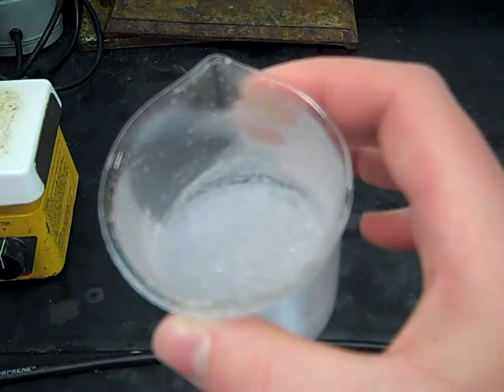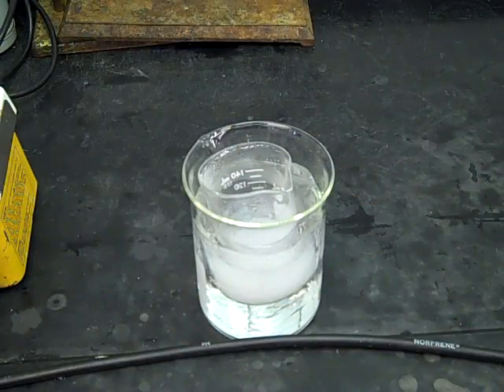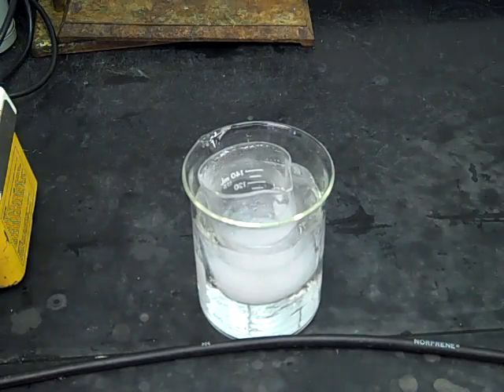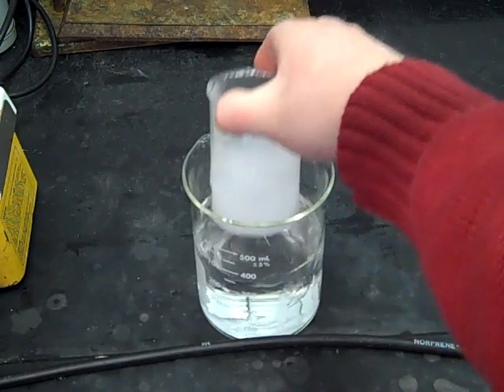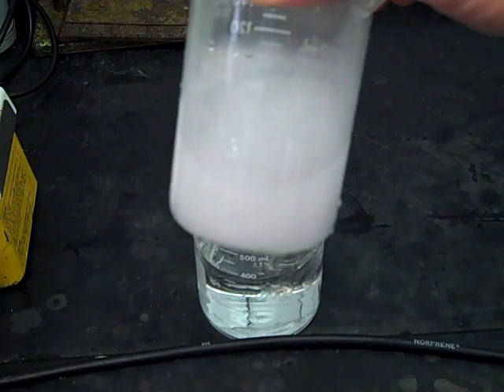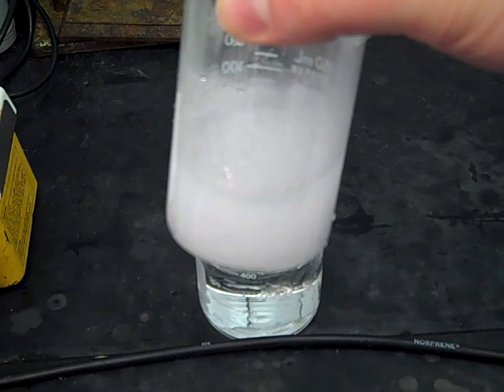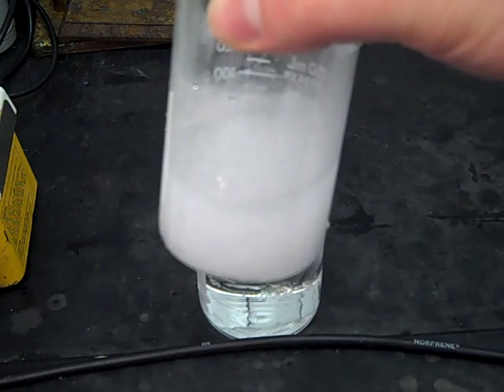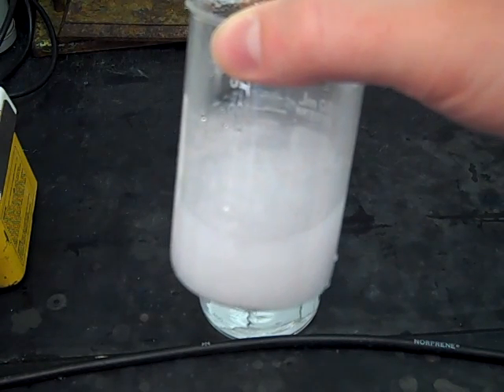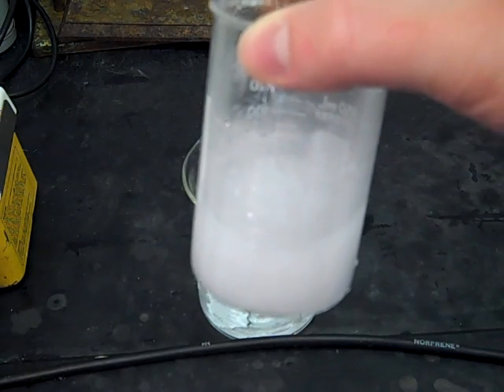We'll let this continue to cool to room temperature and eventually put it in an ice bath. After cooling to room temperature, we've got it in an ice bath and let that sit for maybe five minutes or so. Now you can see there's tons of solid in there — almost the whole thing is white. We've maximized the yield, or the recovery, of our unknown, and any soluble impurities should still be in the liquid. Once you've taken your recrystallized product out of the ice bath, you're ready to move on to vacuum filtration.